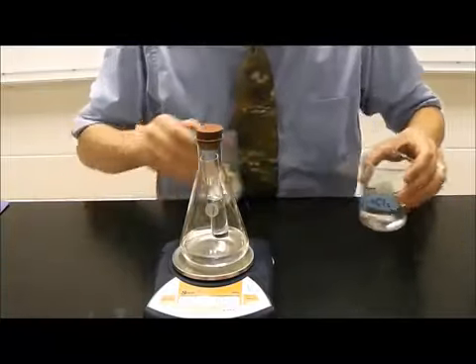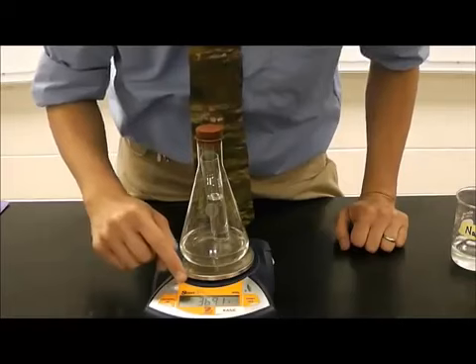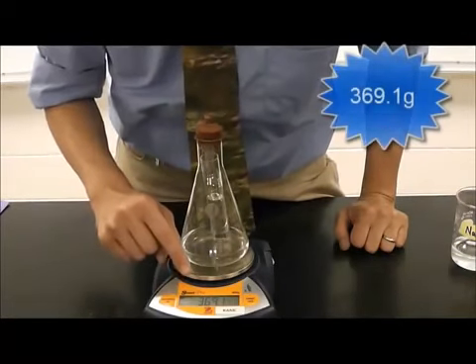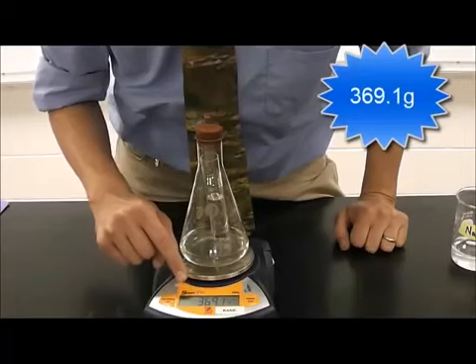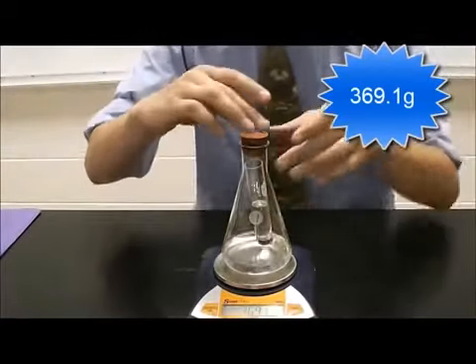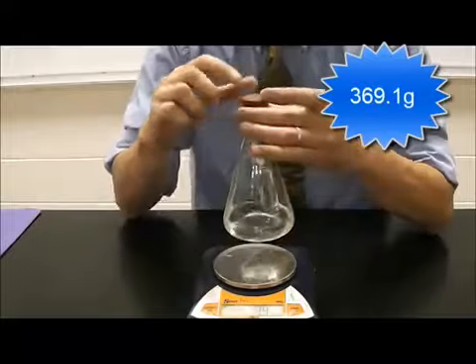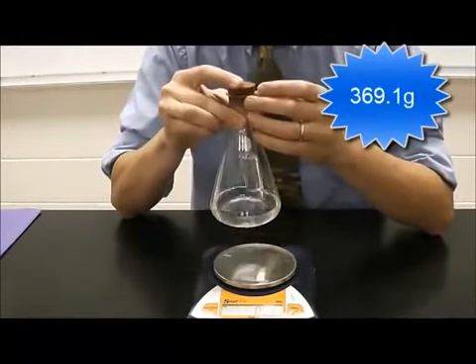And we are now going to note the current mass on the balance. You should be able to read that. It says 369.1 grams. Now, in order to get this reaction to occur, I've placed the stopper on the flask. That way, if there are any gases created, it won't allow them to get out.